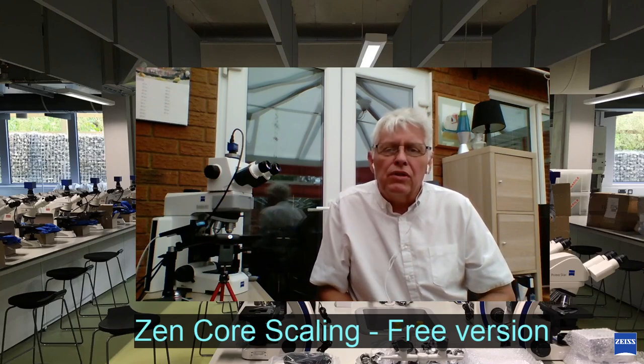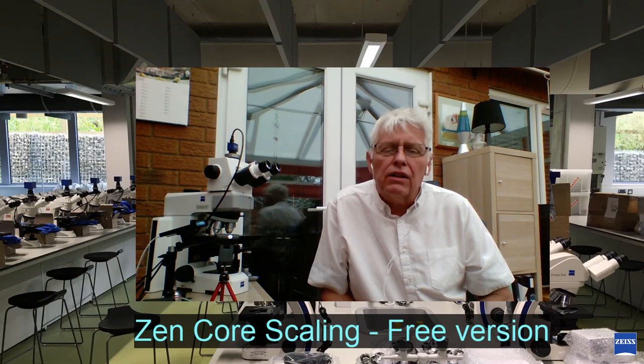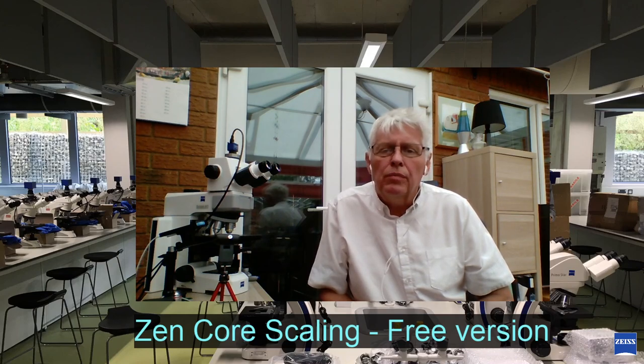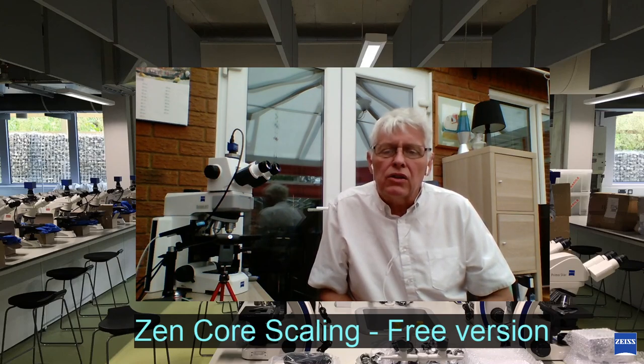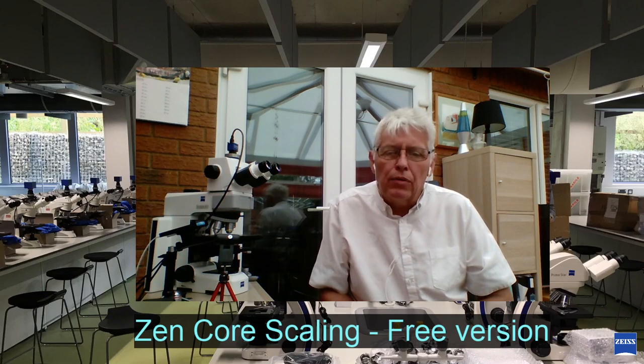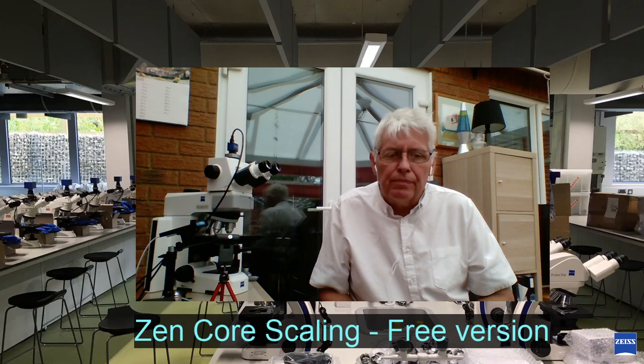Hi, welcome to the Microscopy 101 channel. Today we're going to be talking about Zencore and specifically scaling or calibration, and this is going to apply to the free version.